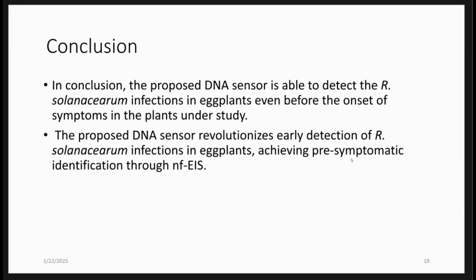So that's my conclusion of the work, that the proposed sensor is able to detect Ralstonia solanacearum infection even before the onset of symptoms on plants. It revolutionizes early detection so that appropriate measures can be taken to prevent the disease from spreading.